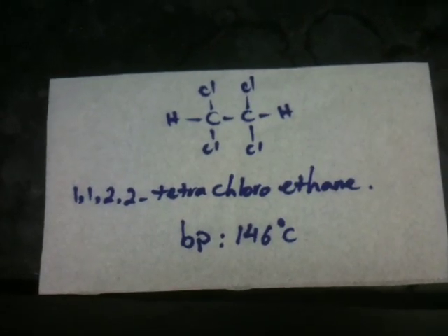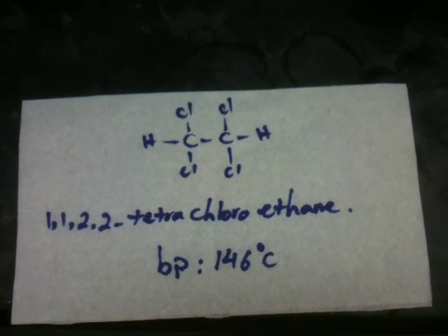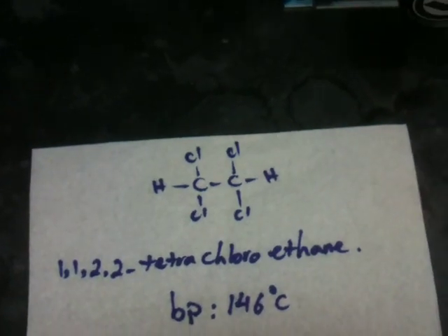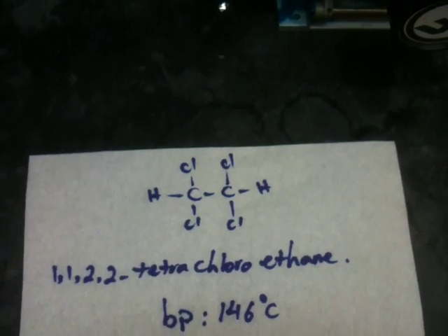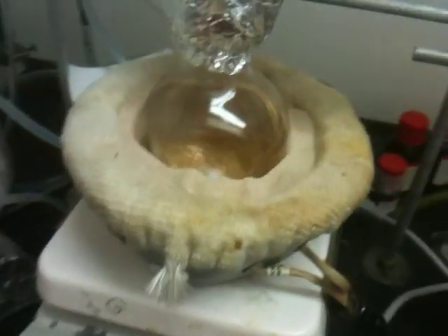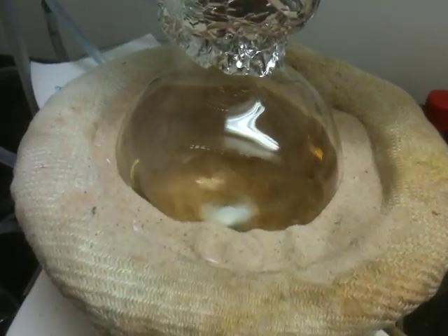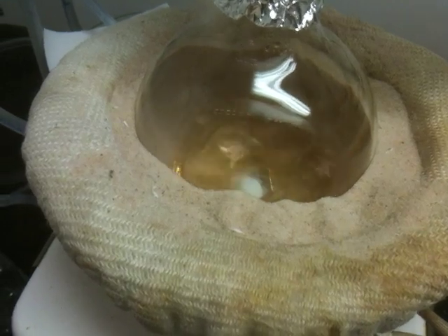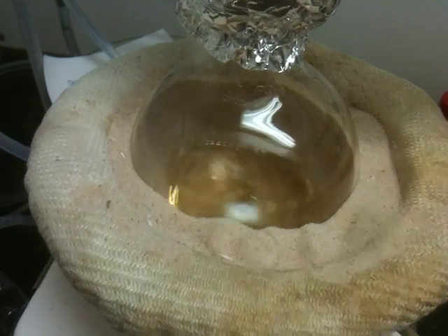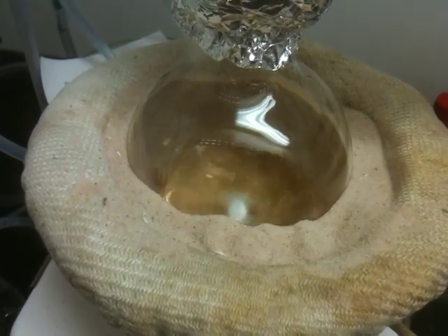Tetrachloroethane is a very toxic solvent but it is very useful, so be careful handling this compound. It's supposed to be completely colorless. It has a strong smell, but because I got my solvent from a very old bottle it was pale yellow, and I realized I have to distill it to get rid of the impurity. It was a little bit lighter than this color, but as I'm boiling off more solvent, this is condensing and it turns to darker yellow and finally a brown mixture.